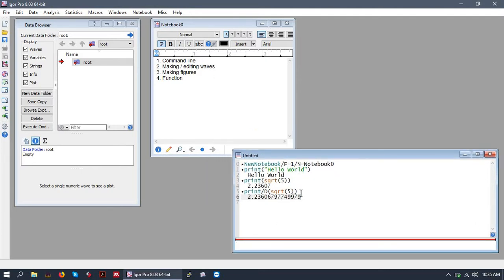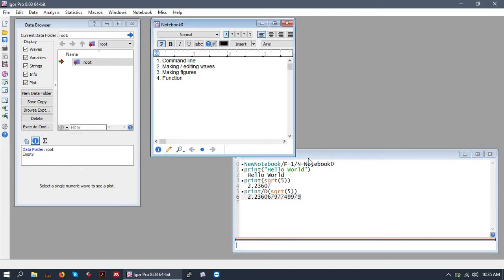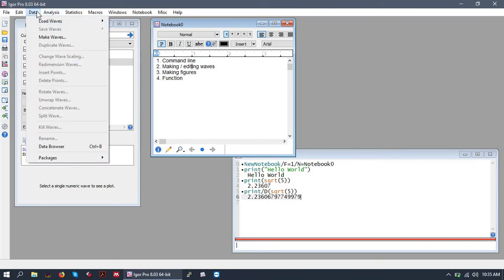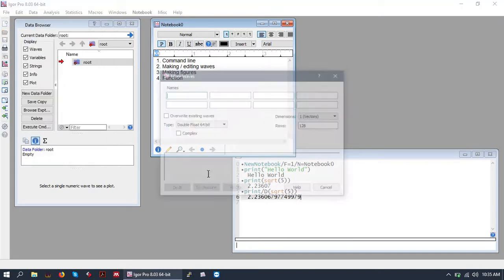So that's the basics of the command line. Next, we're going to make and edit some waves. So to make waves from the graphical user interface, you go to the data menu and click make waves.